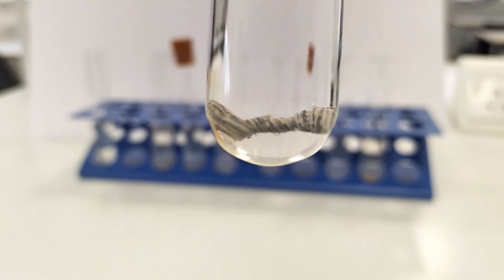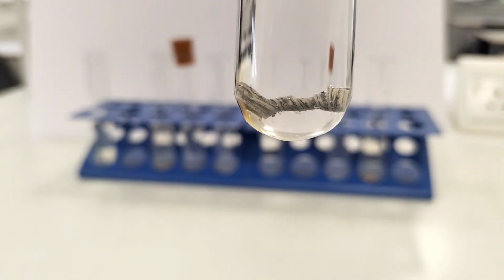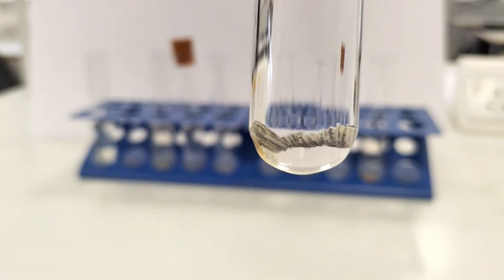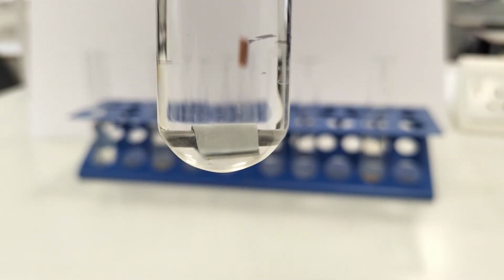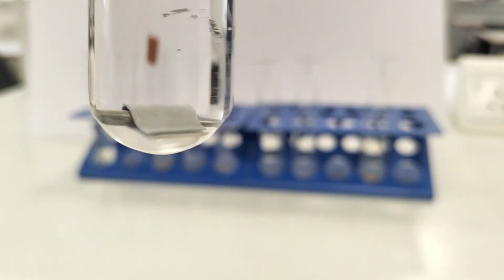And in fact, if we chose a metal which was a little bit less reactive than magnesium, but still more reactive than iron, it might have a more prolonged protective sacrificial barrier effect, and might be more suitable than magnesium for protecting iron from rusting. In experiment 7, we used zinc rather than magnesium. And again, it looks to be the case that the zinc has done a good job of protecting the iron, with only a bit of rusting at one end.